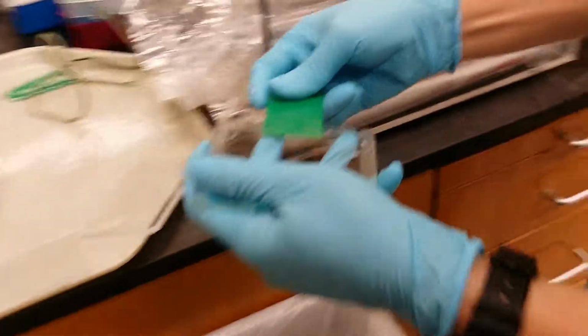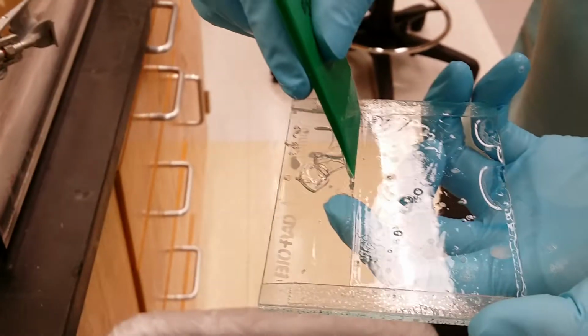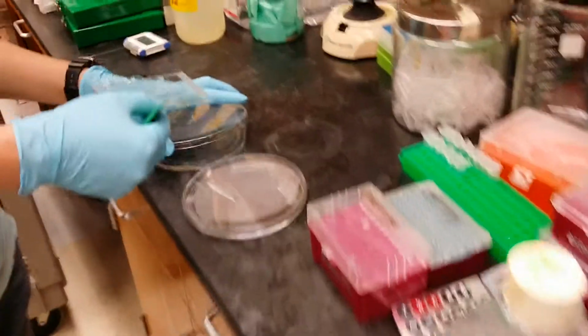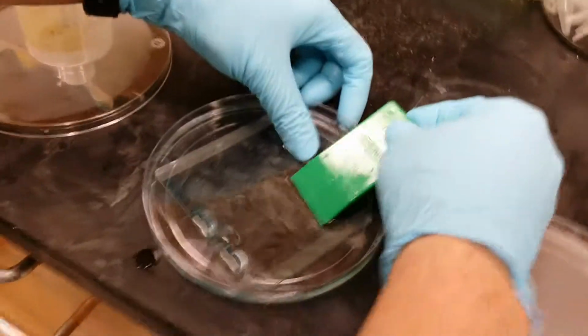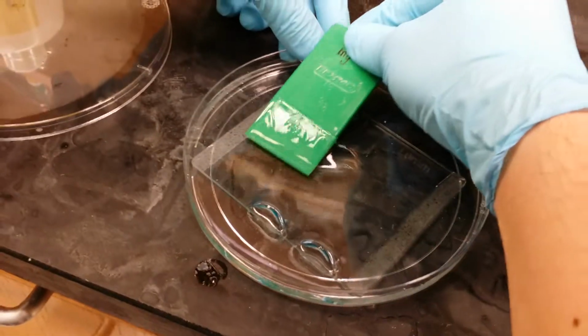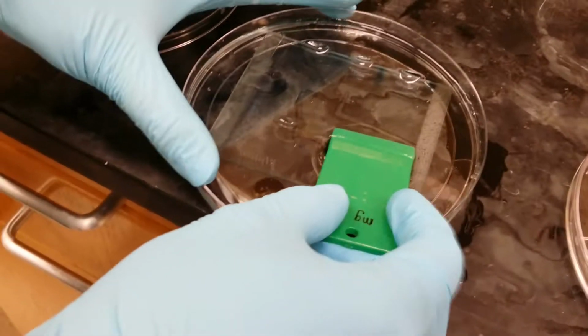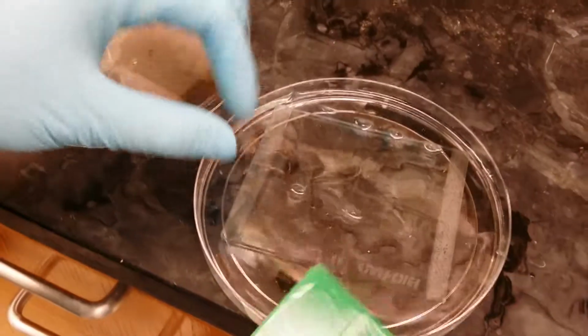Now here's the critical part, I think at least, you know, getting the glass off right. Oh, cut the stacking gel off, yeah. Did you do it at the bottom too? No. Oh, now it's loose.